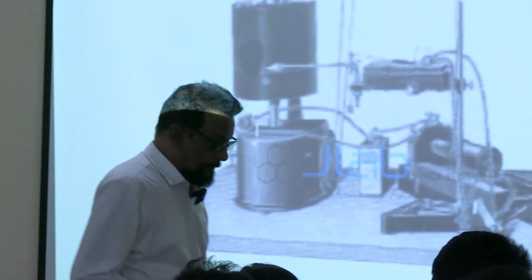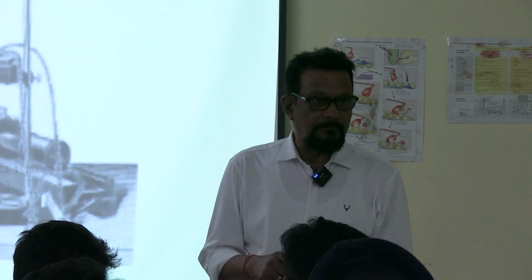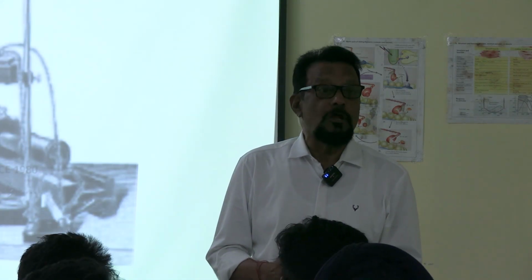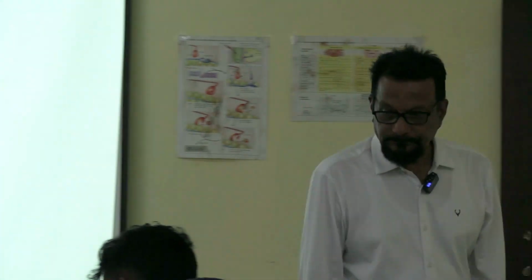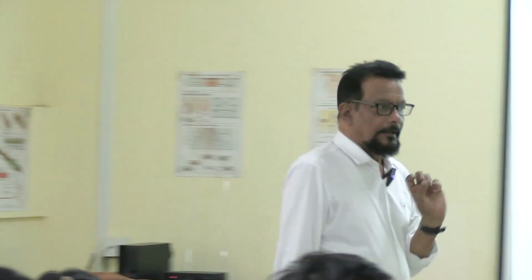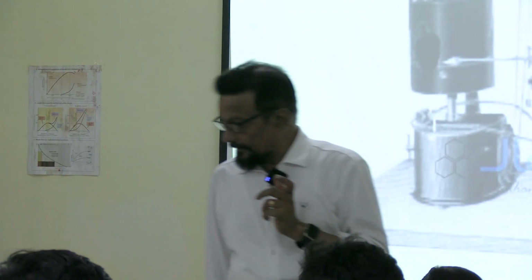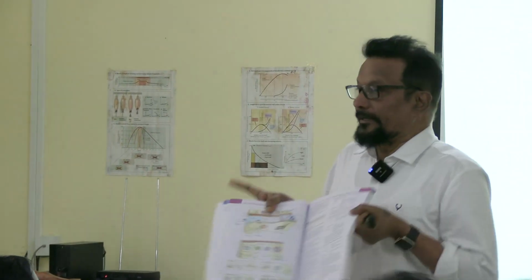Nowadays, instead of the Du Bois-Reymond induction coil, an electronic supply is available, called the student stimulator. Maybe you have the image of the student stimulator in some books. Yes, this is the student stimulator.